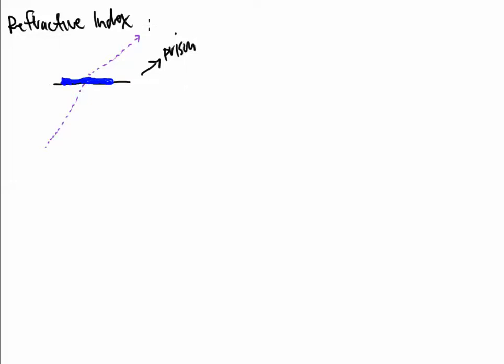The same thing is happening with refractive index. What's going on is that we are shining a light into a sample, typically liquid, and that liquid is bending the light just like the pool water does, and we are measuring the angle that it bends. That is the purpose of the refractive index, and that's the purpose of the refractometer. That is what we call the instrument that measures, of course, the refractive index.